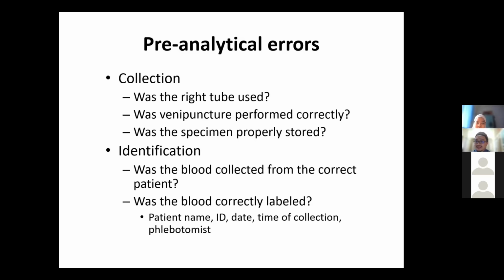Okay, so the lab tahulah. In case I have someone in the lab also MAMS, the lab people they have to create another initial for me lah. So when you initial, you do not have to put your whole name. Malaysian kan nama punya ada panjang, Muhammad Affendi bin Muhammad Syafri, panjang nak tulis. So just put MAMS. MA tak boleh, MA mesti banyak. Okay. NS like Nur Shakira, dia mesti banyak NS. Sometimes kita go up to 4 letters.